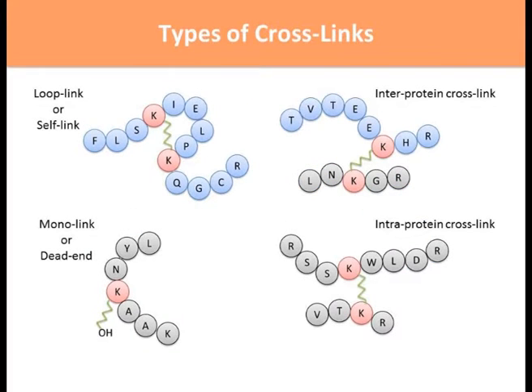After digestion, there are several types of cross-linked products that are produced. Among them, they each have their own names. What we have is called a loop link or self-link. I usually use the term loop link, so you'll probably hear me say that throughout the remainder of the lecture. This is when the cross-linker occurs at two points within the same peptide. In other words, there was no additional lysine or arginine to separate these sequences. They remain a single peptide with a cross-link between it.